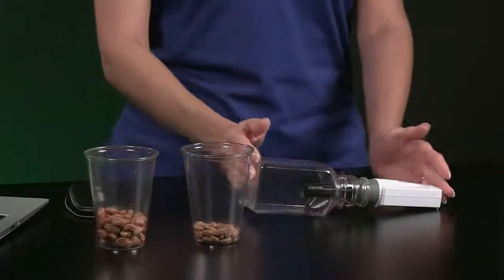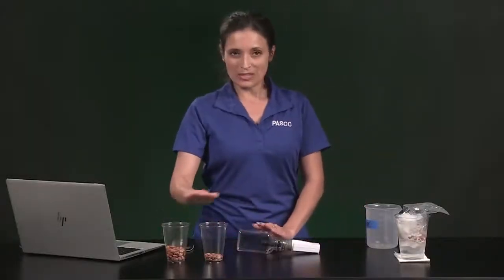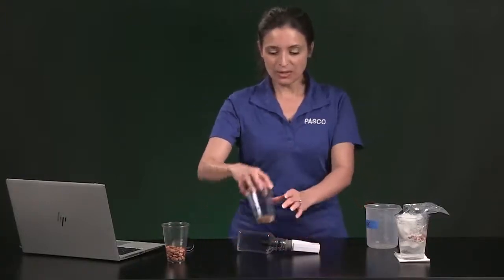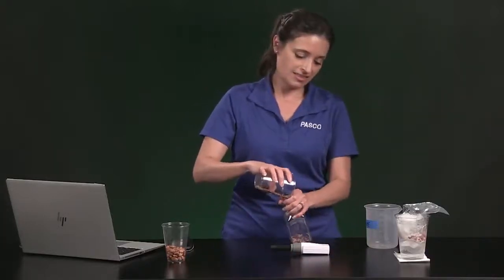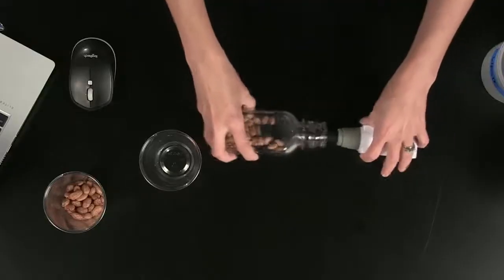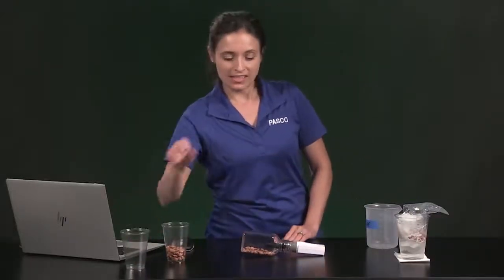So when you put the sample in the container, make sure that nothing's touching the probe, and when we get to the wet samples, that there's no water touching that sensor. Okay, I'm going to place the dry seeds into the container. And I'm going to run the experiment sideways like this because carbon dioxide is heavier than air. And this way we get the maximum measurement of CO2.